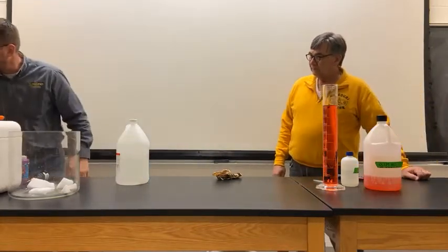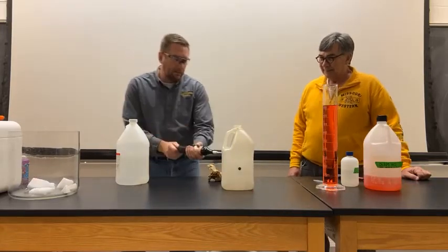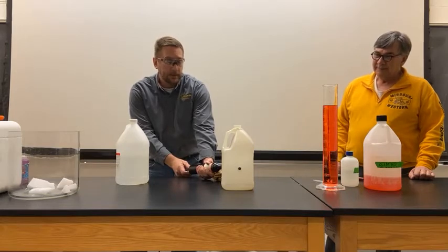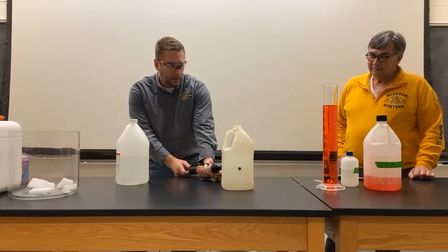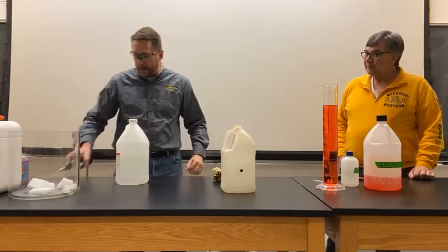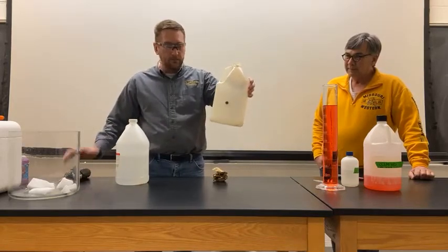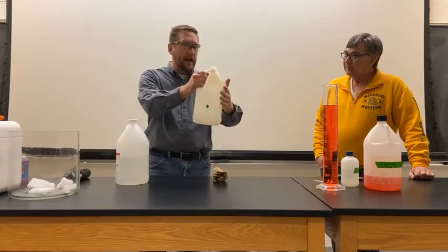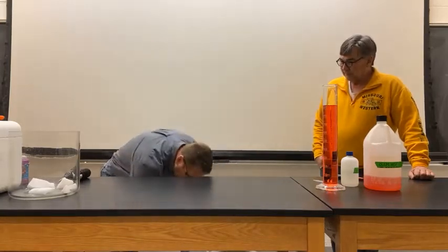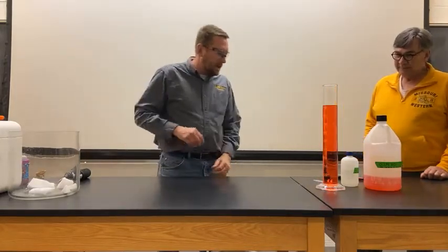And we're going to see that we really don't get much. Yeah, see? We can't ignite it again. The reason we can't ignite it again is that it's filled with carbon dioxide. I didn't allow the carbon dioxide to come out of my bottle here. So that gives us some evidence that, in fact, we filled this up with carbon dioxide when we did that reaction. Okay, so let's go on to some other pieces here.